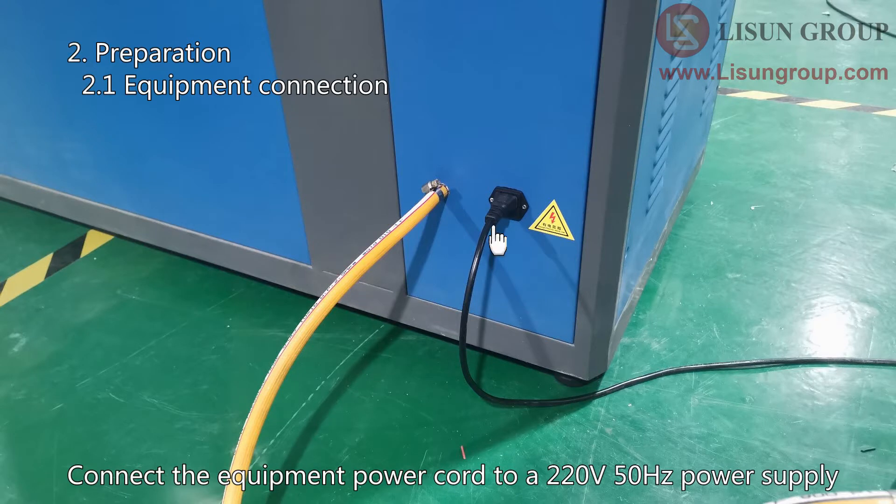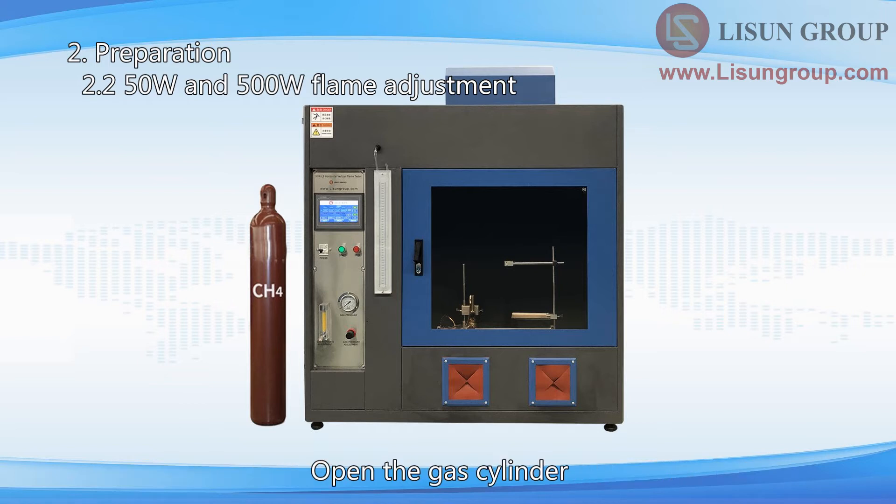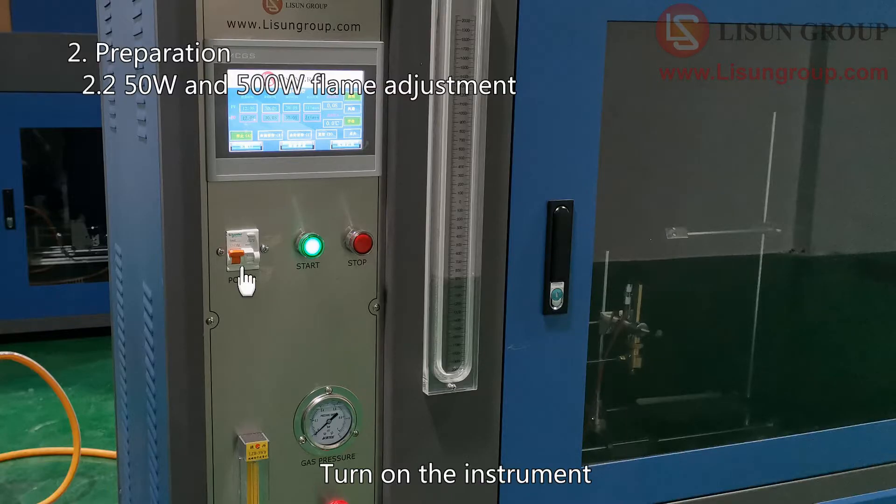Connect the equipment power cord to a 220V 50 Hz power supply. Generally, a 50 Watt flame or 500 Watt flame is required for testing. Open the gas cylinder. Adjust the secondary relief valve of the gas cylinder to 100 kPa. Turn on the instrument.